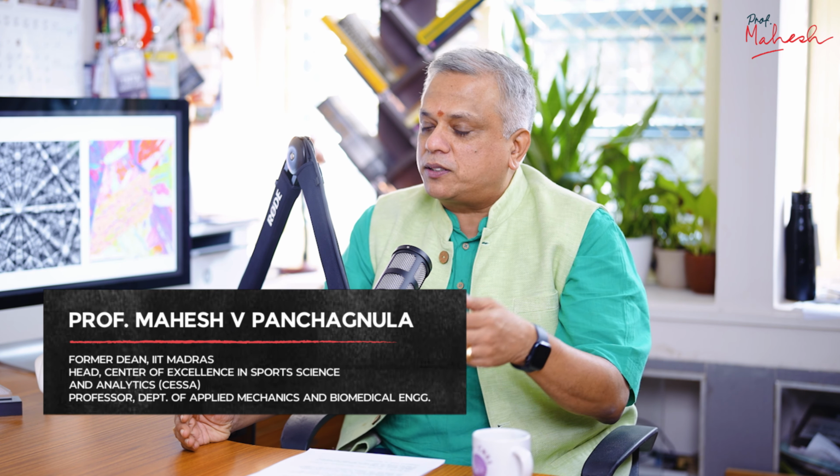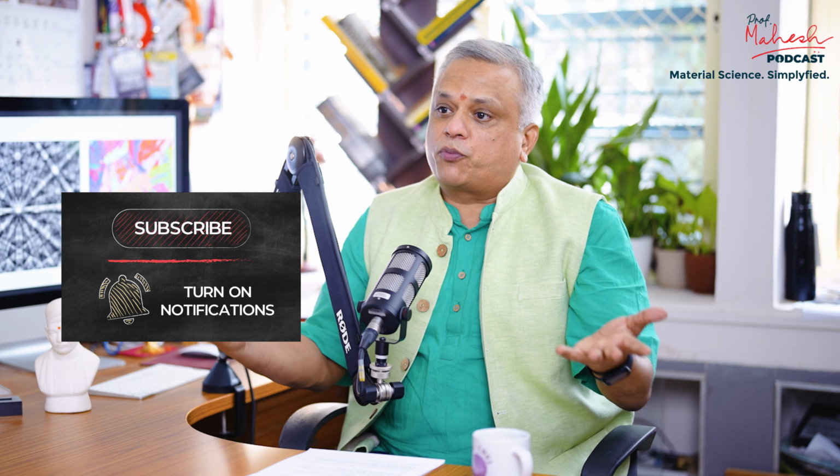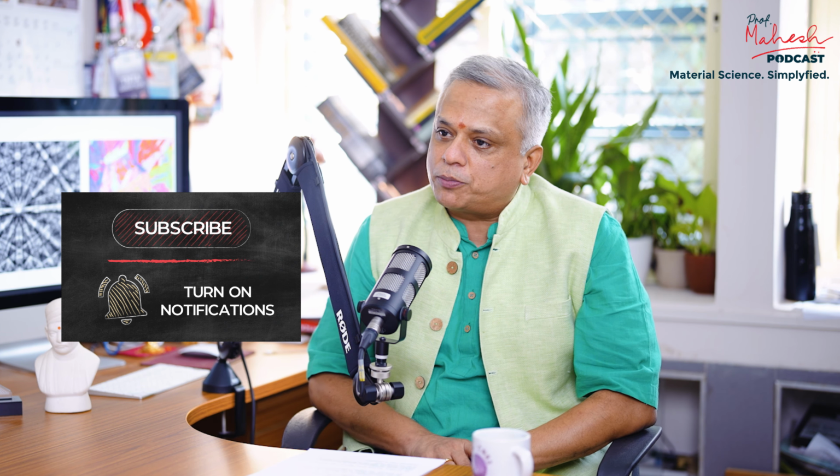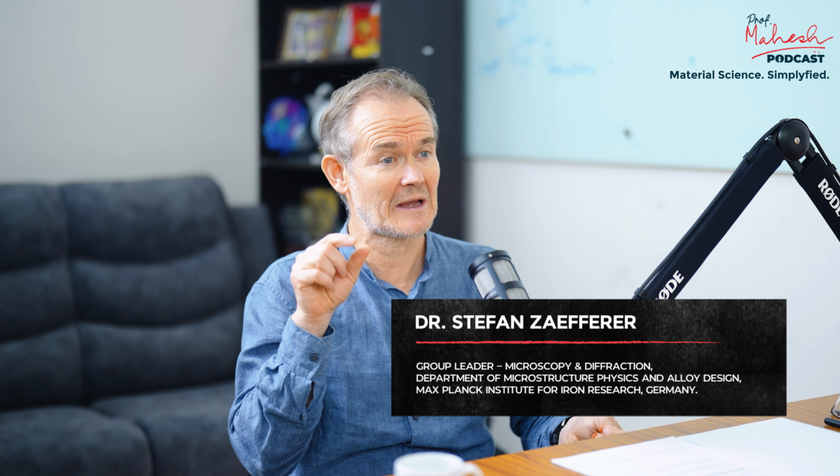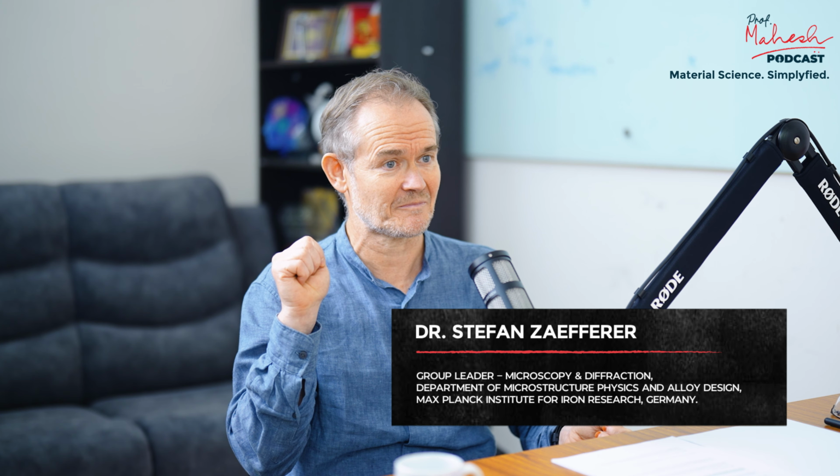Tell us a little bit about the more advanced techniques like EBSD. And what does EBSD stand for, and why is it a preferred technique for certain measurements? Okay, so EBSD is of course an abbreviation for Electron Backscatter Diffraction.